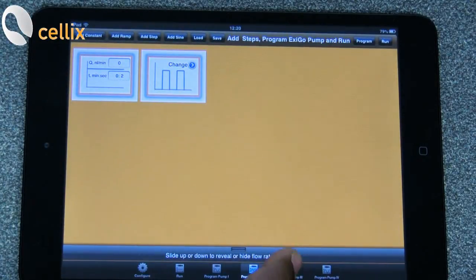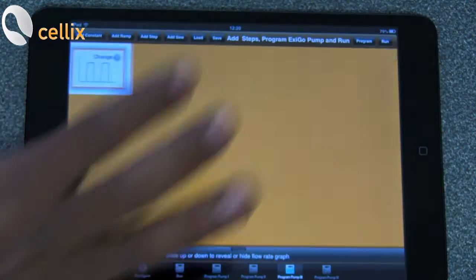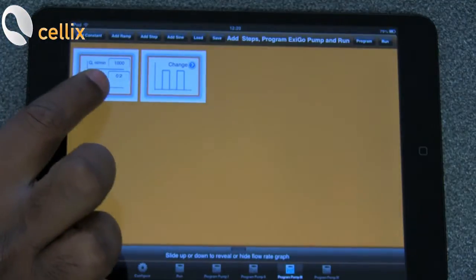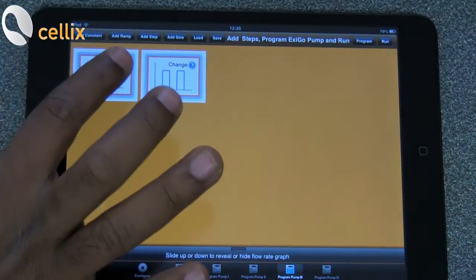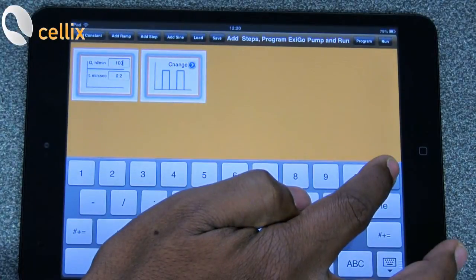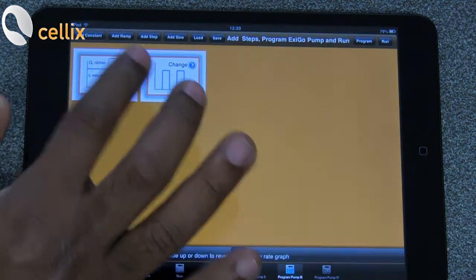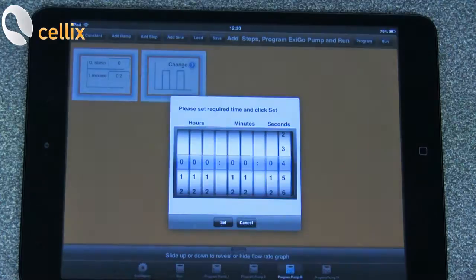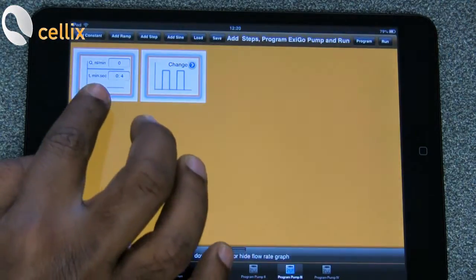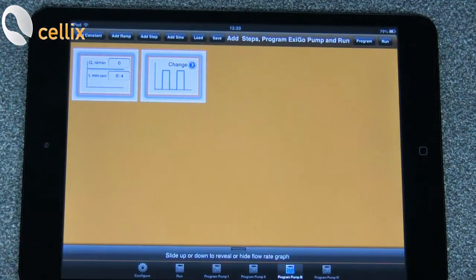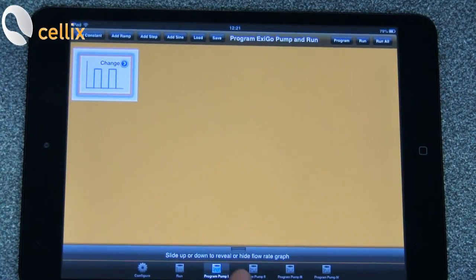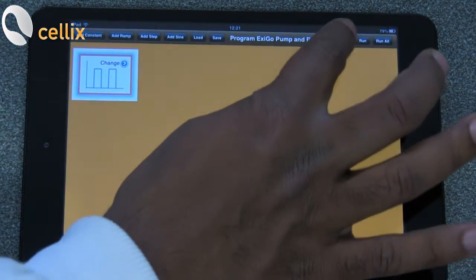Then you go to pump 3, click load. So you have the parameters there where you need to change this to 0 and here 4 seconds. So once you have set all the parameters, you can go to pump 1 and click program.